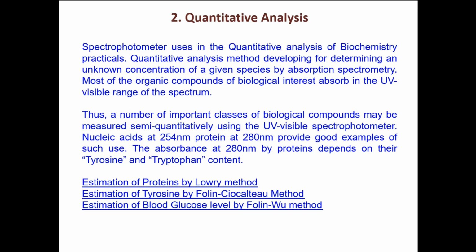To measure DNA, there is a standard formula. In case of double stranded DNA, one OD is equal to 50 micrograms of DNA. Whereas in case of single stranded RNA molecule, one OD is equal to 40 micrograms of RNA.